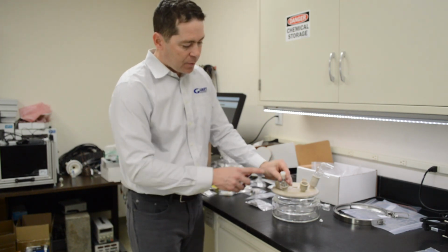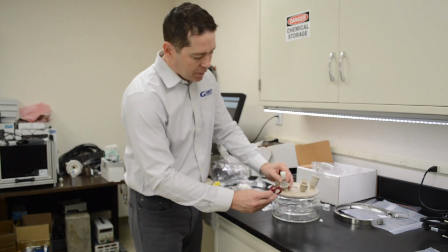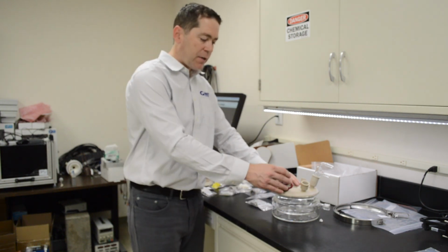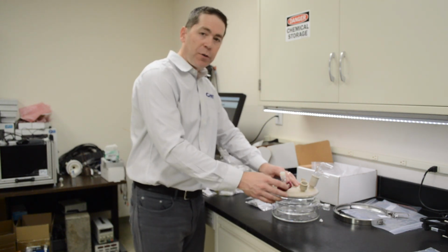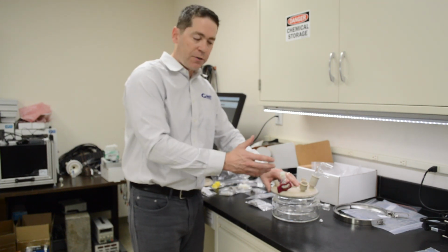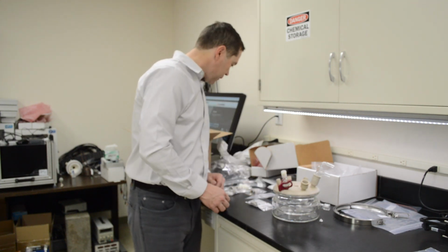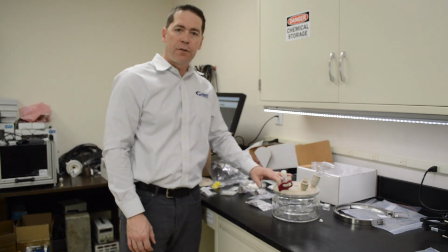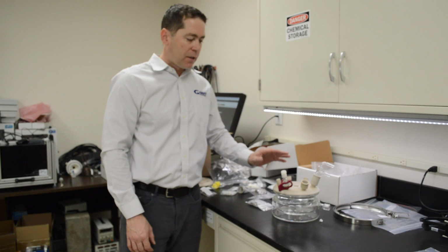use this adapter to mount your reference electrode in here, and then of course the clamp holds it in place. And so this moves until you put the clamp in place. That allows you to put the reference electrode as close to the working electrode as you need to. So there we have it. That's our 1 liter rotating cylinder electrode glass cell.